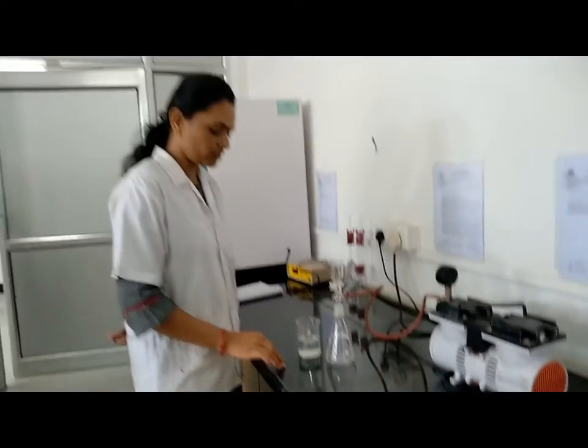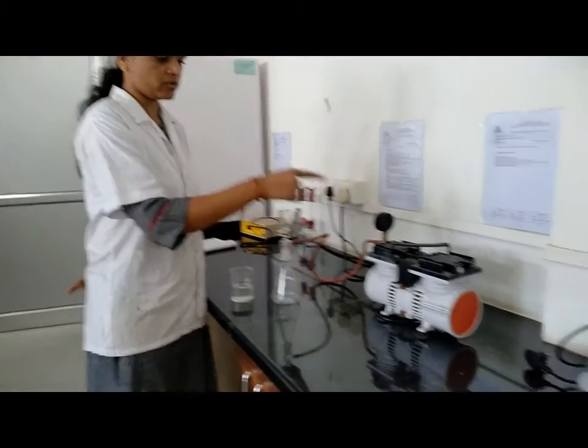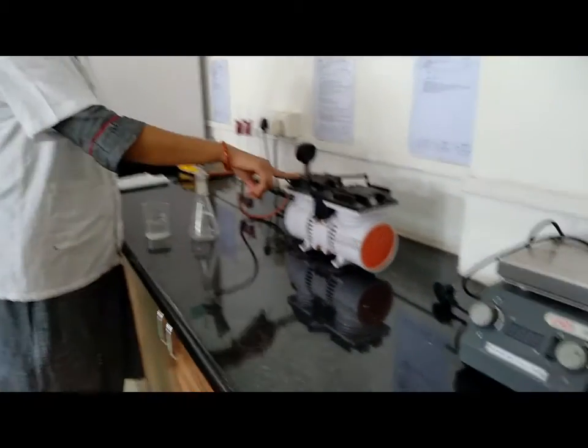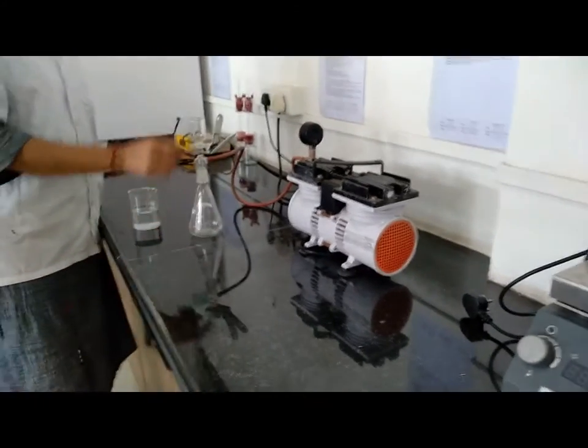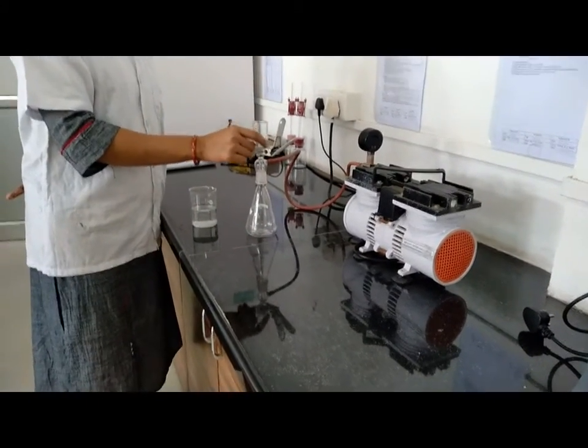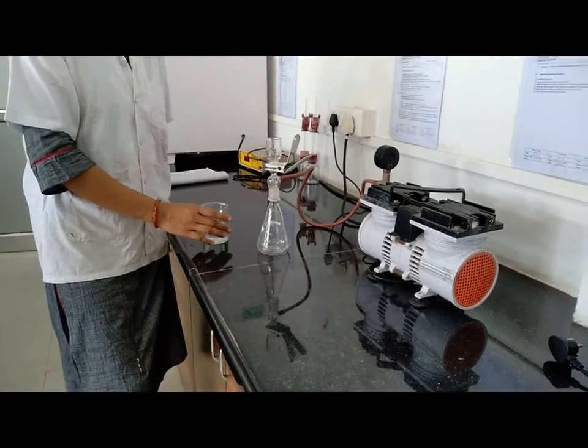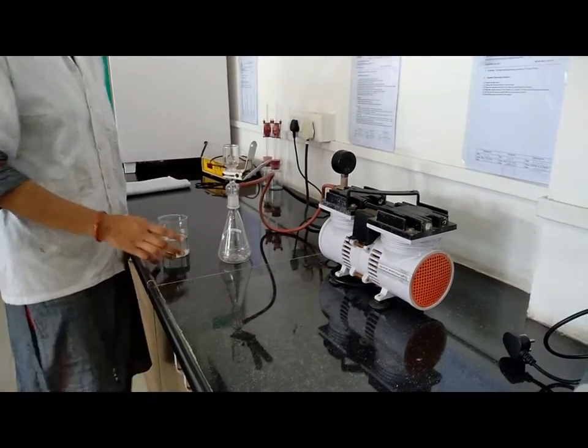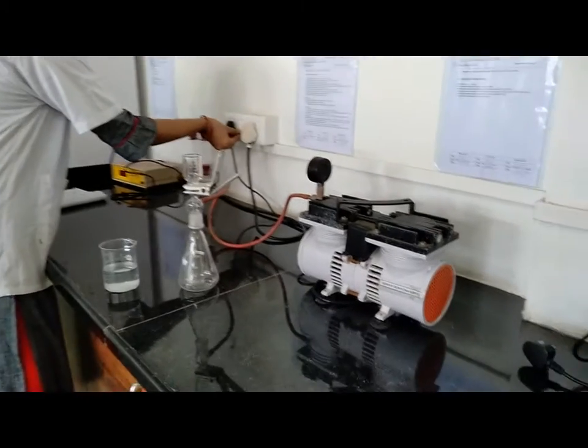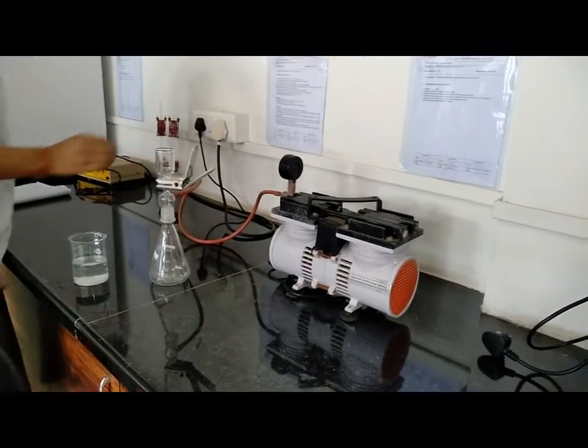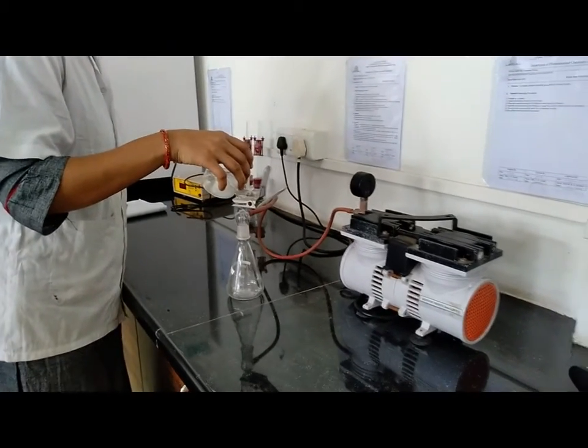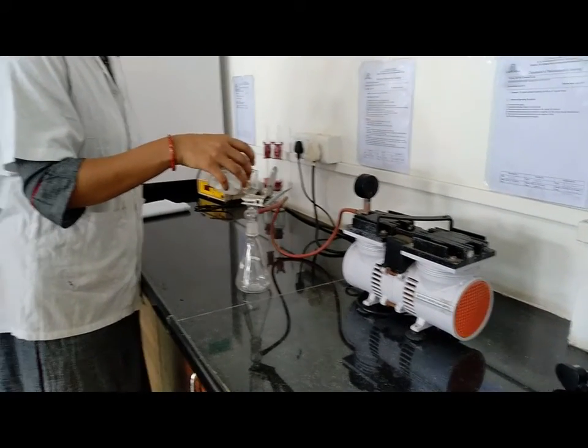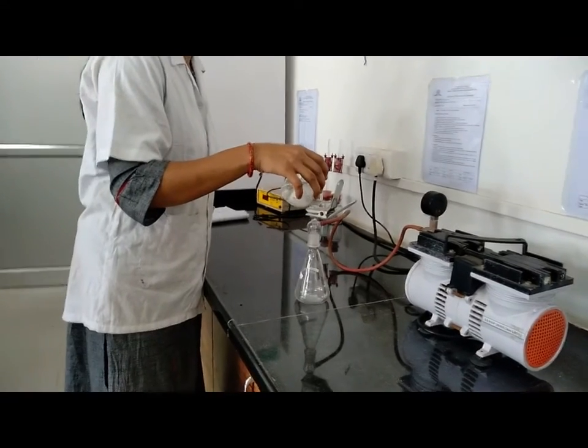We have to filter this white precipitate which we are getting from the synthesis using this filtration pump. This is the vacuum pump, this is the Buchner flask, and this is the funnel. By using this assembly we have to filter the white precipitate. For that we have to start the filtration pump.